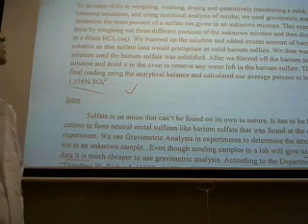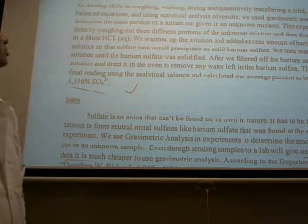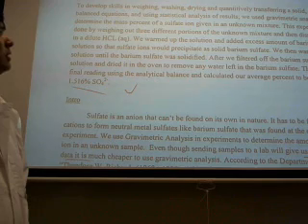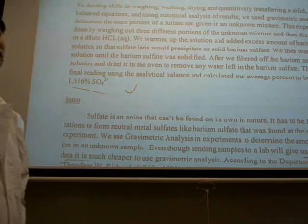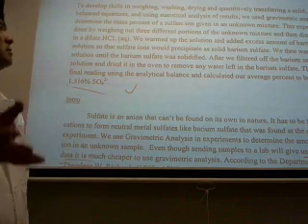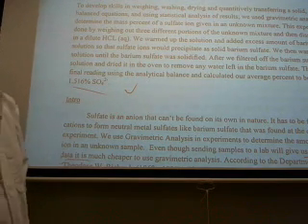By using balanced equations and using statistical analysis of results, we use gravimetric analysis to determine the mass percent of a sulfate ion given in an unknown mixture. You don't have to make it sound fancy. Just something simple is fine, but this, in your own words, is better. I appreciate. Since this is the first report, my expectations aren't super high for this.